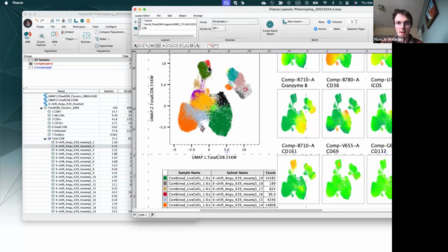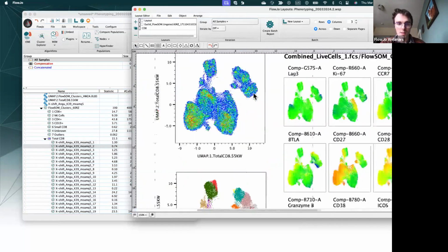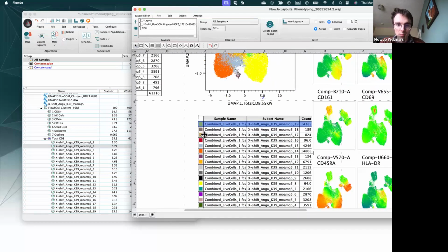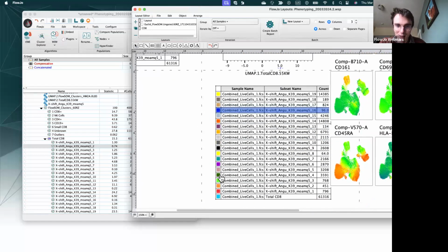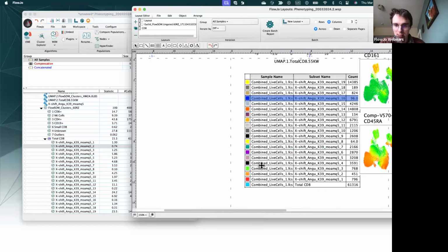The easiest ones to identify are, of course, these 2, which are both the MR1 tetramers. I'm a little confused about what colors these are. Let me just, nope, that's not it. Maybe it's this one. Make it blue. Nope, still not it. This is the colorblind person struggling with a limited color palette. I'm going to make this black. That's it. All right, so it is cluster 4.